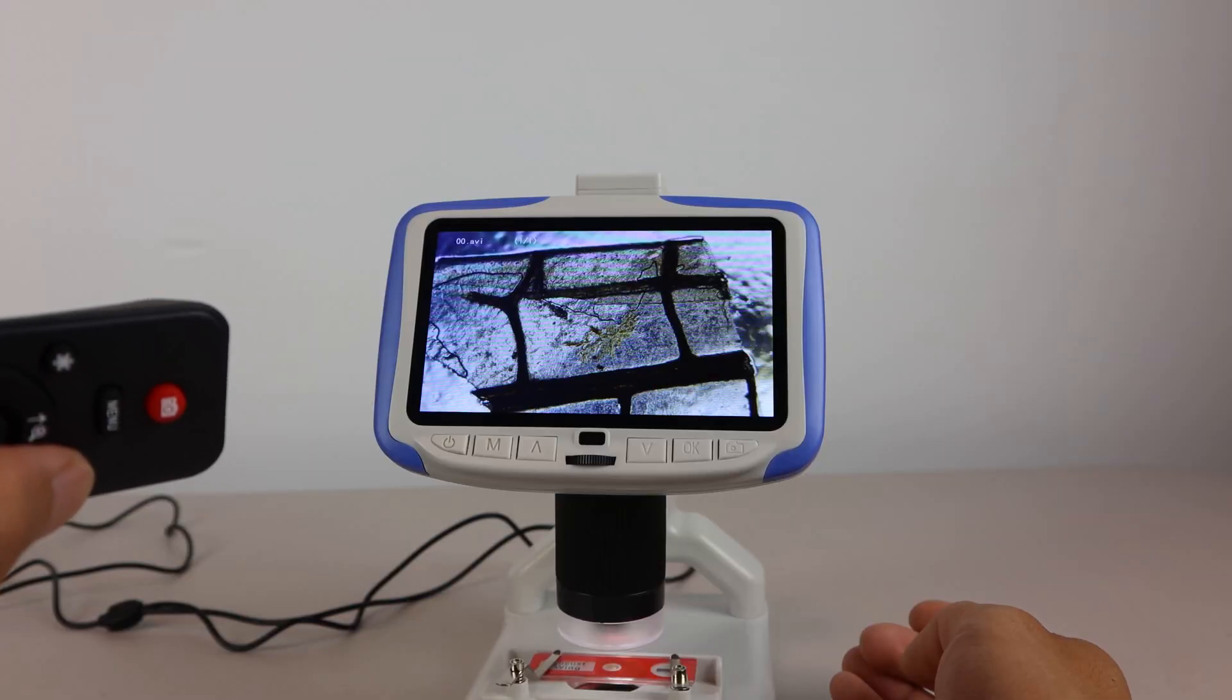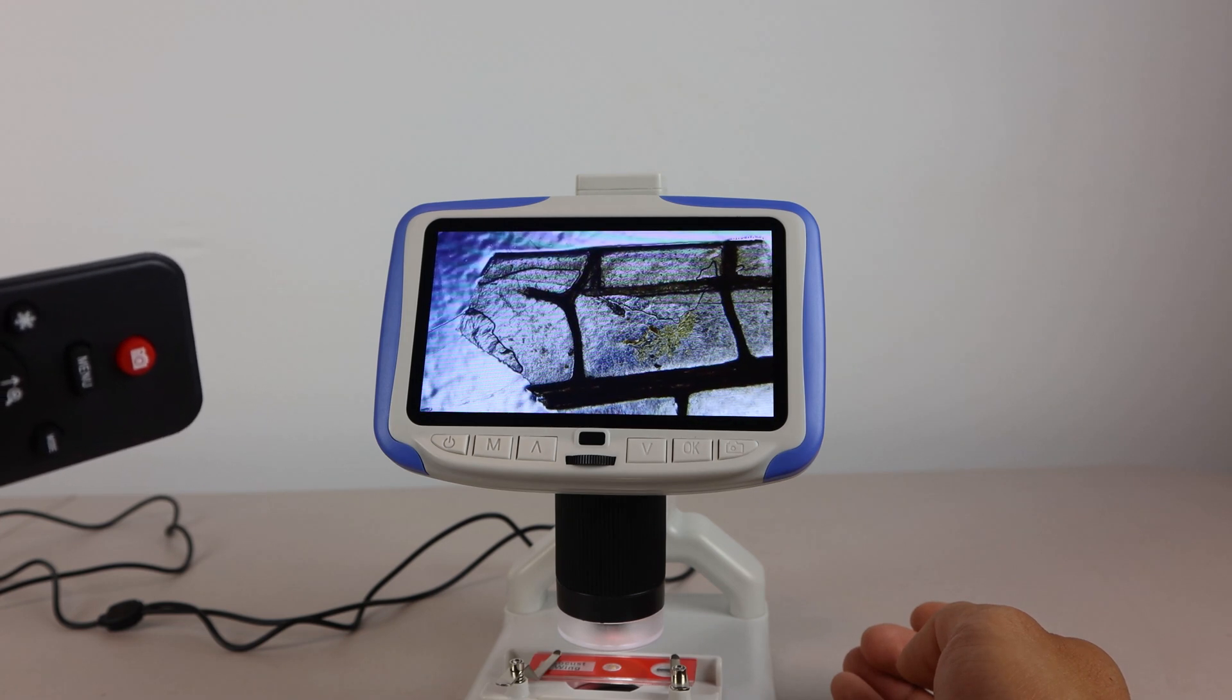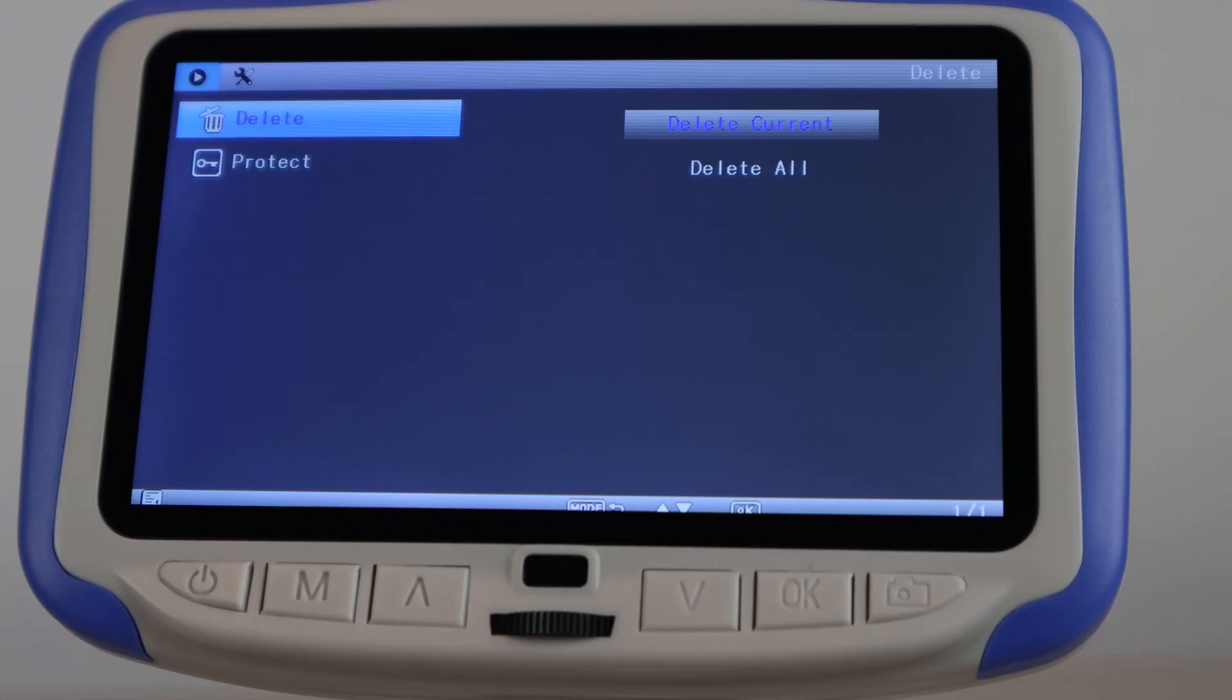The third mode is playback mode, and you can view the recorded videos and photos that are saved to the SD card. You can also choose to lock or delete them.